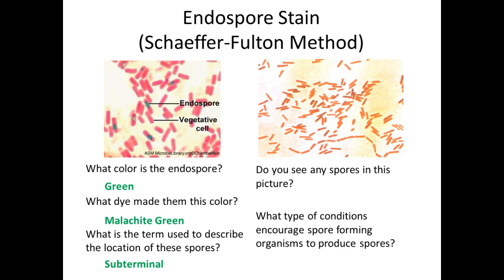Do you see any spores in this other picture? No. Just cells, yeah. There might be like an artifact, but if you were to see spores, you would see them, right? And again, you would make sure you scan around on your slides, right? There's lots of surface on that slide. You're only looking at a small portion under the microscope. But in this case, no green structures, no endospores.